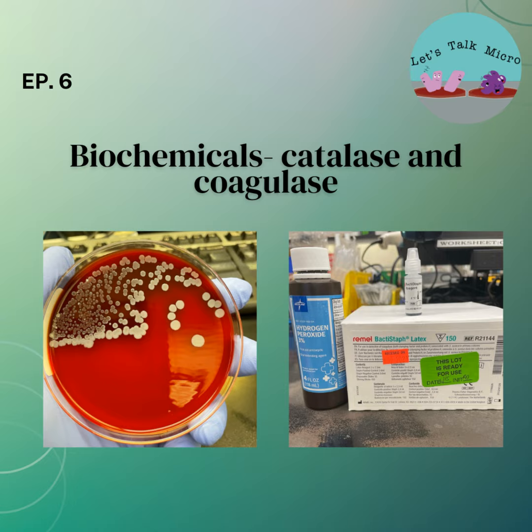I also talked about how helpful it is when you have white colonies. Let's say you're in the urine bench, you have these white colonies, a quick wet mount. You can see if it's Corynebacterium, gram-positive rods. You can see if it's yeast. When you have alpha colonies, you do a quick wet mount. You can see the gram-positive cocci in chains. Granted, with that, you might have some difficulty sometimes. You can see the gram-positive rods, the long thin rods, which are indicative of Lactobacillus. And in that case, it will be normal urogenital flora.